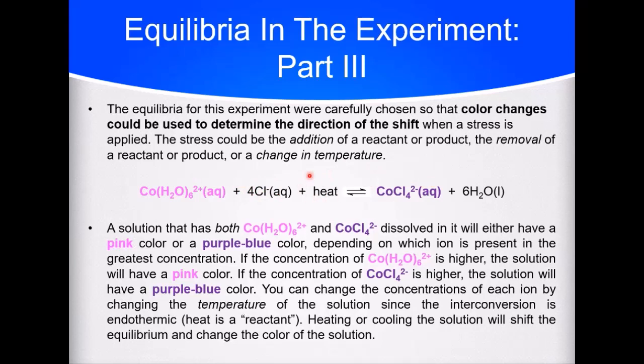We are messing with the temperature of our reaction, which, again, arguably we could say that heat is a reactant here. And so we'll see by changing the temperature what the color of our solution is and see if that will tell us, have we shifted left or have we shifted right?